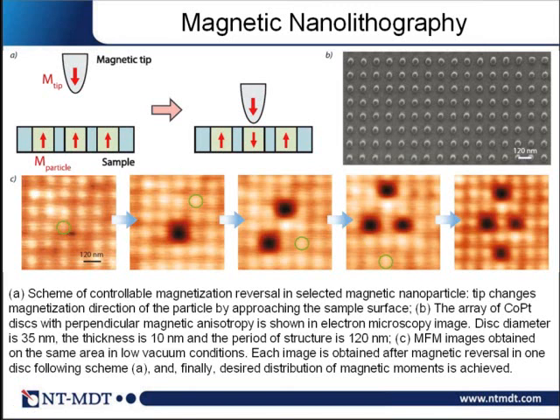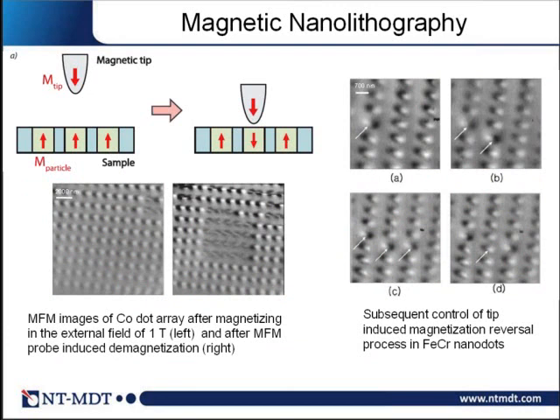and in general it can be used for magnetic storage. A recent development of the magnetic storage industry is so-called patterned media, where the information will be stored using one element, such as a disk, and the problem of how to address this information in such patterned media is a very challenging task, and magnetic force microscopy can definitely contribute to this development.